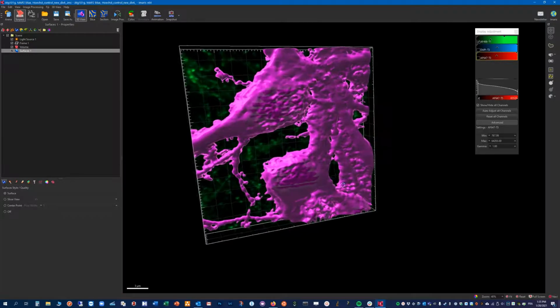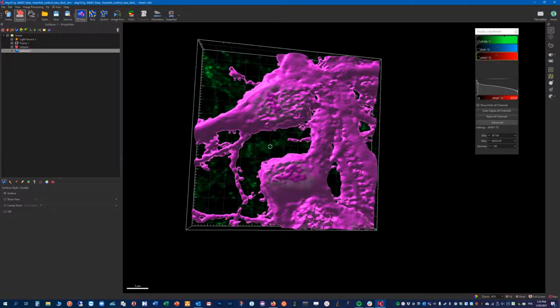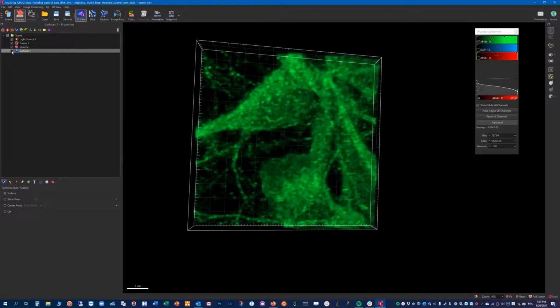Now that we have this unique object, which we can see by just clicking on it to select it, we have to separate it into its different components. So let me just switch this off for a moment. We have obviously one cell here that is roughly defined by this curve.